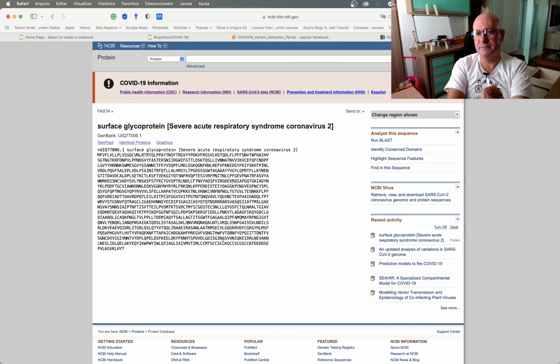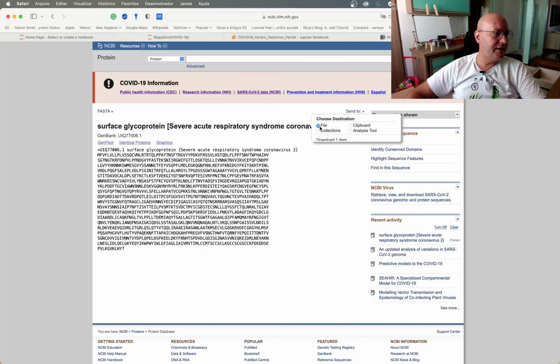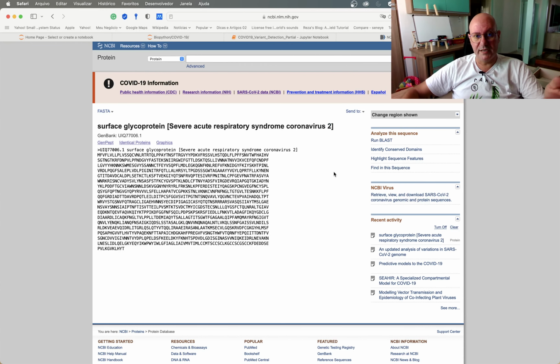The output of that, the person can connect to the internet or place a micro SD card or whatever, and the person will get a plain text file with this information here. And then, of course, if you want to, you can download it. I chose FASTA because Biopython is prepared for that. They have libraries for that. They have libraries for other things here as well, but you can download it and test to discover the variant. We don't know the variant here. What we know from this information is that the person is really infected with the coronavirus SARS-CoV-2, right?